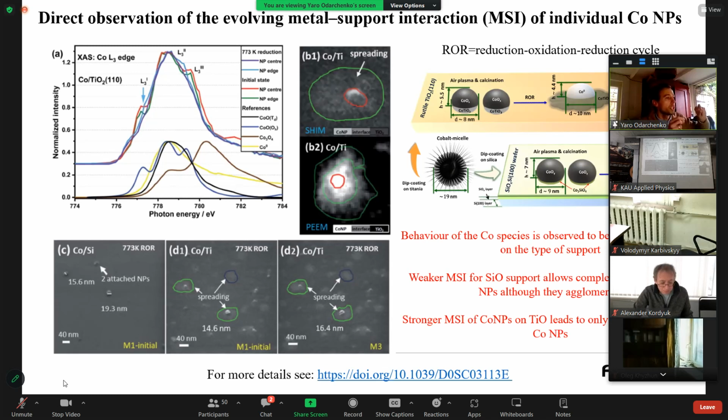Therefore, we are putting markers, and after measuring spectroscopic data, we take the sample and put it into the microscope and measure with electron microscopy the exact size of the particles and how they change. And you could see here that, depending on the nanoparticle center or nanoparticle edge, we saw slightly different spectra, and these variations were exactly due to the oxidation state of the nanoparticles.